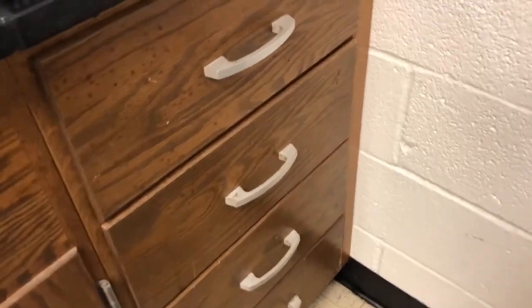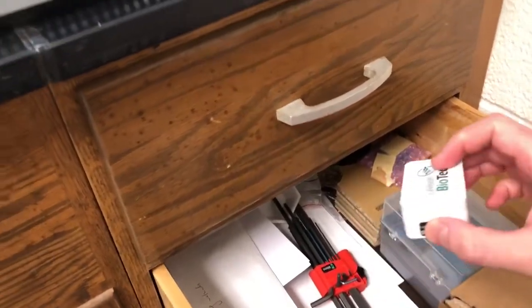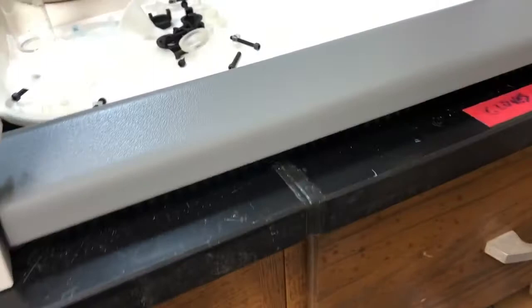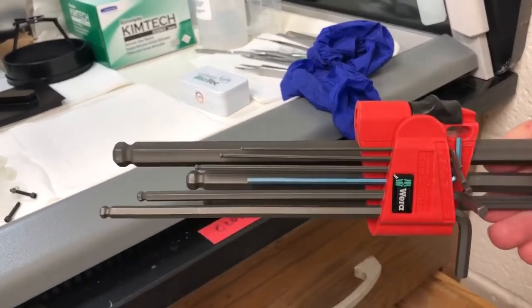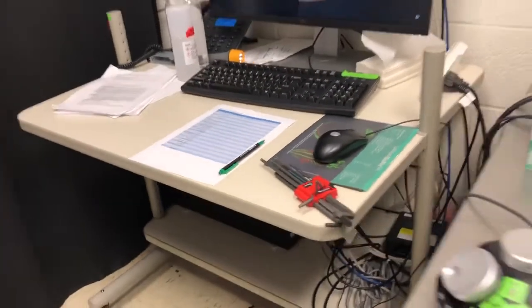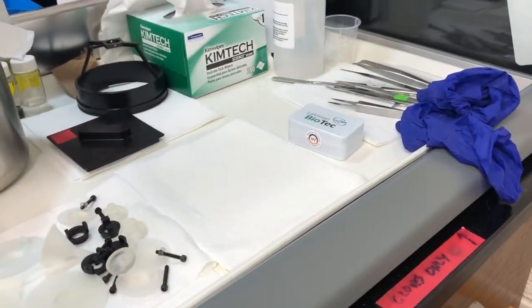There are a few things we'll need for alignment. The tool is in here. This box — you shouldn't touch the bottom with your bare hands, but the sides are fine. I put it in here in the hood. That's where the alignment tool is. The other thing you'll need are all these Allen wrenches. And we'll need some business cards, just to block different combinations of beams.